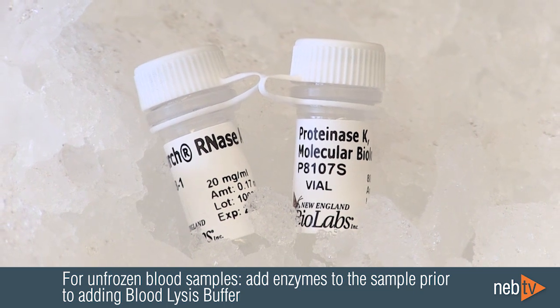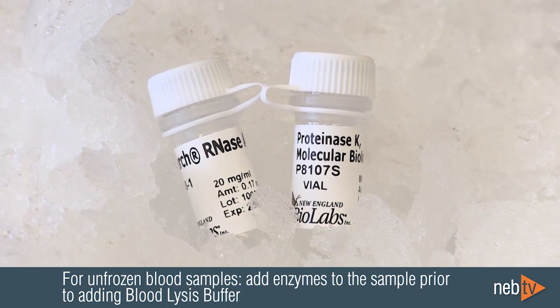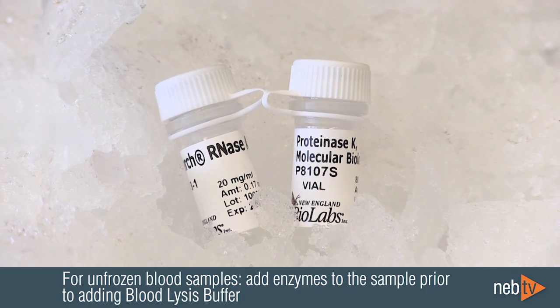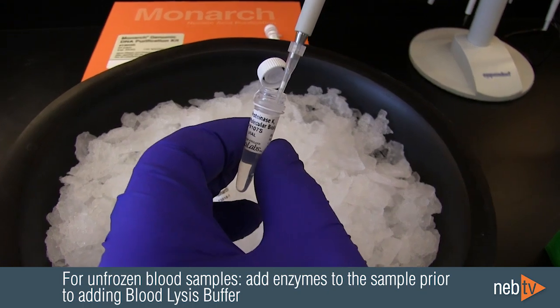For unfrozen blood samples, it's important to add RNase A and proteinase K to the sample prior to adding the lysis buffer, so that the enzymes can quickly degrade the nucleases that are released upon lysis.